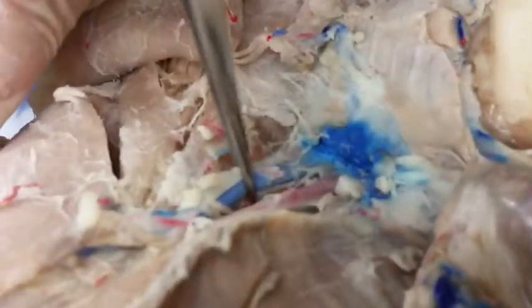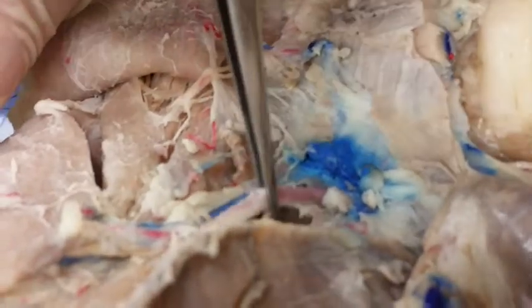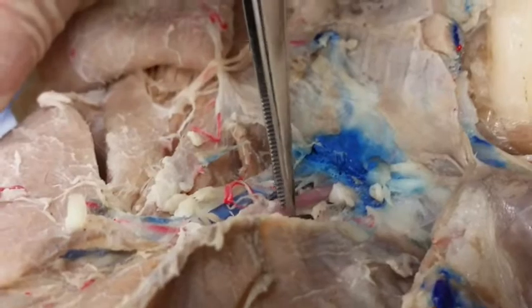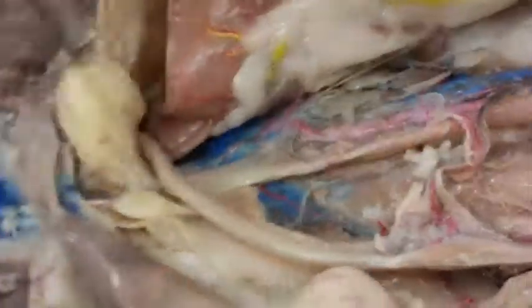leading down in here now into the leg, we again have the vena cava, the posterior vena cava, and the dorsal aorta. And then we also have the caudal mesenteric artery, which is kind of more up in this area, but it all kind of comes down and flows.